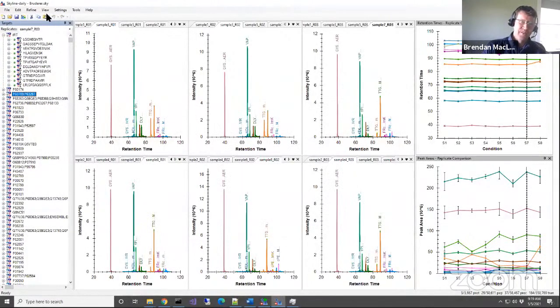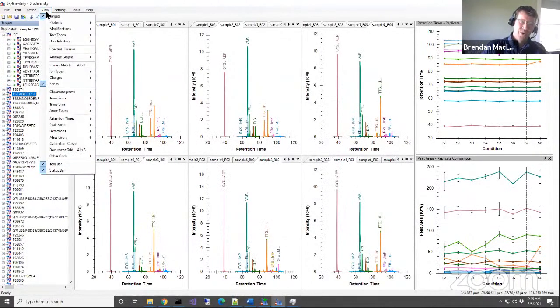The other thing that I would almost always check is the retention time. We saw that we got better weight out of the retention times in our scoring than we got out of mass errors, but we still would want to check the regression, score to run.